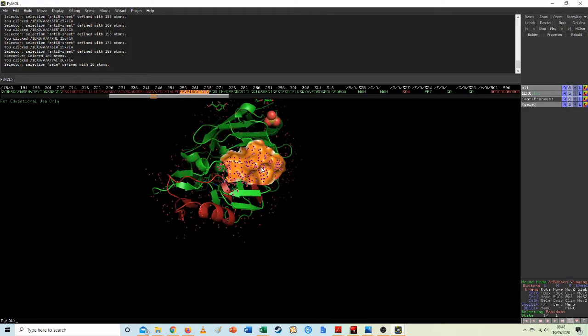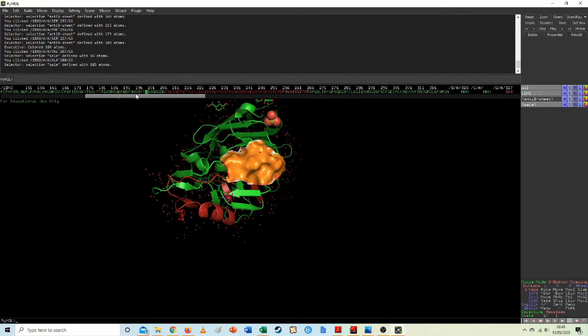Now, what I'm going to do is deselect this now that the surface is shown. Like that. Oh dear. Oh, I can drag it. That's quite nice. Right. Now, we're going that way. So that's forwards. Yes. Good. Okay, where was I? There.